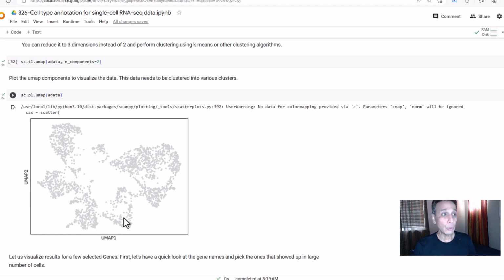Now you can choose to divide these into 1, 2, 3, 4, 5, 6 clusters, or you can choose to say, hey, this is a different cluster, 1, 2, 3, 4, 5, 6, 7, 8, 9. You can divide this into infinity. Well, you can divide this into however many dots you have, right? So what is the right balance? That you have to experiment with in an iterative way. But how do you control that?